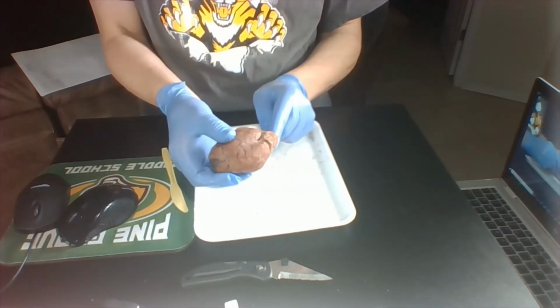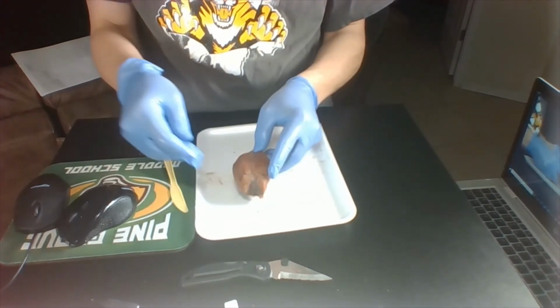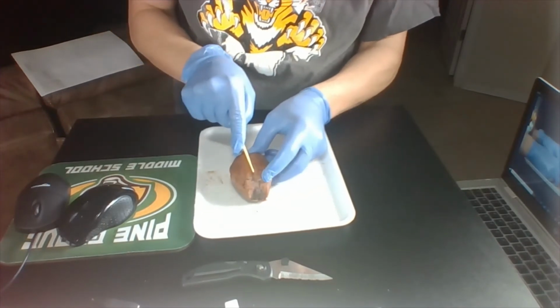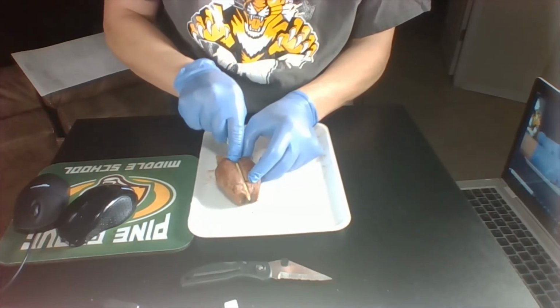Like I said, the brain stem is very different, but the way it's angled, there are a lot of similarities. So we'll see if this plastic knife will work. It's from the dollar store. Let's see if we can slice it. It is pretty soft. It looks like it might work. Yeah, it's going to work.